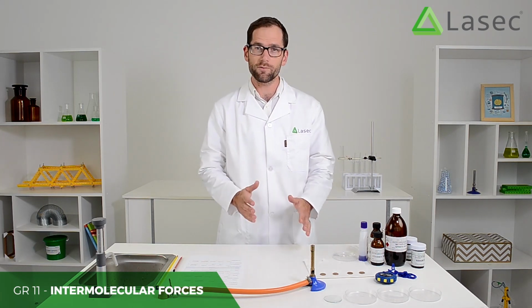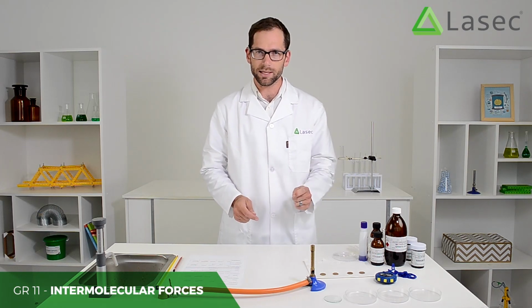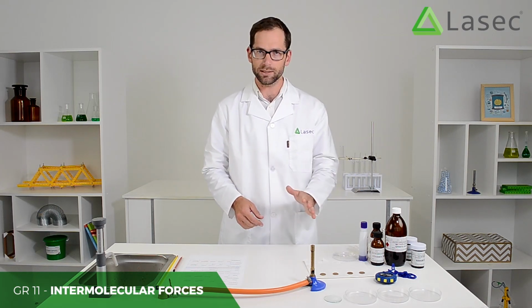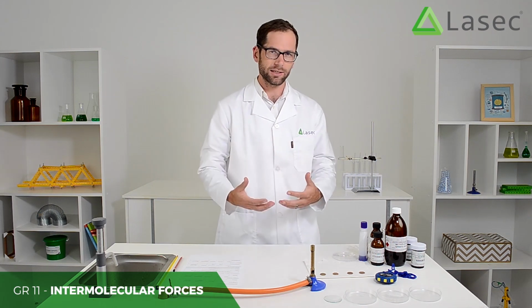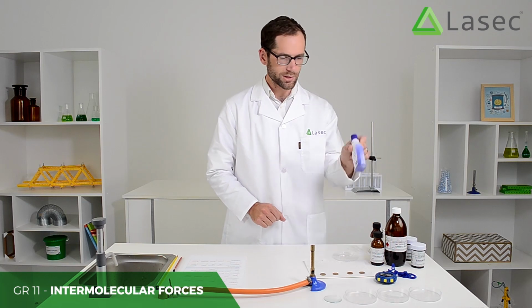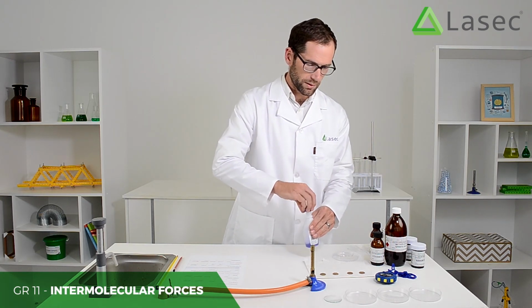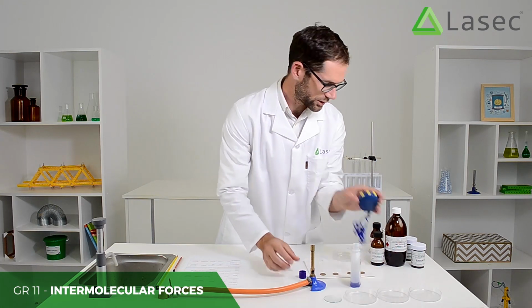Right, so what we're going to start off with is evaporation. So they're going to be able to time how long it takes for the liquid to evaporate, and then be able to relate that to intermolecular forces. So we'll start off with a quick one, which is nail polish remover. And I'll get my stopwatch ready.